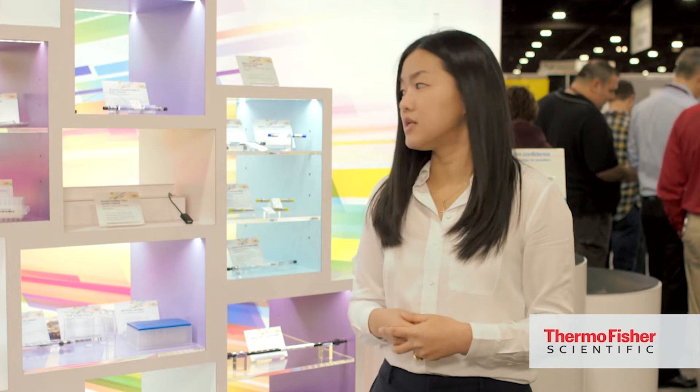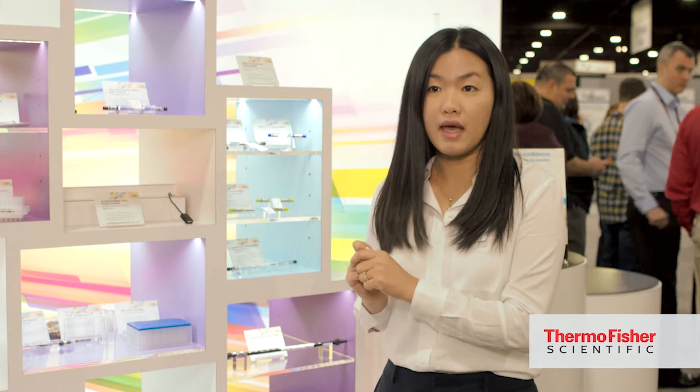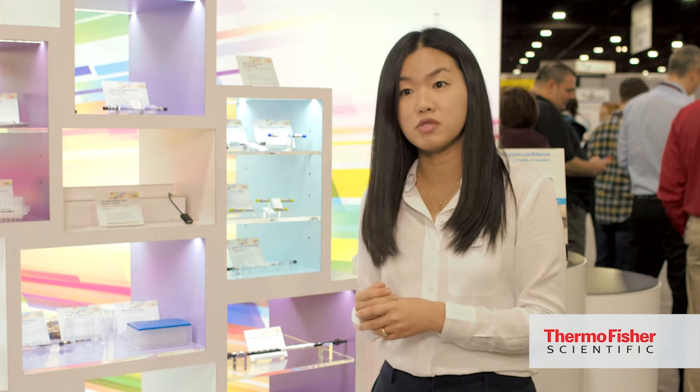This column is specifically designed for oligonucleotides and is based on a wide pore polymer resin. Because it is a polymer resin it can withstand high pH and high temperature. It can analyze short single stranded oligonucleotides as well as long oligonucleotides, and also double stranded DNA fragments up to 10,000 base pairs.